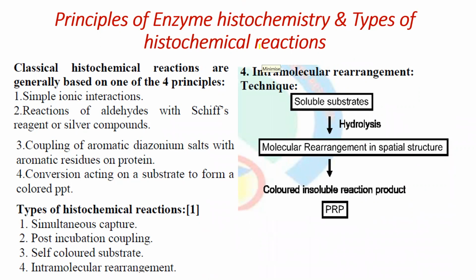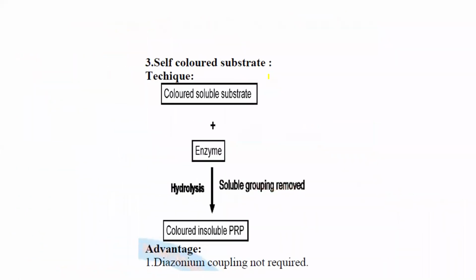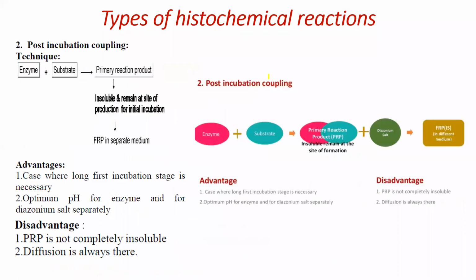Do we add insoluble substrate in post incubation? Jasmin is asking, do we add insoluble substrate in post incubation coupling? One second. We are not going to add that. That is already developed. Let me show you here. See, the enzyme and substrate themselves made the insoluble component. Now, to this insoluble component, the salt will react. We can say one thing: this insoluble substrate is not so stable. It is only a weak insoluble substrate.